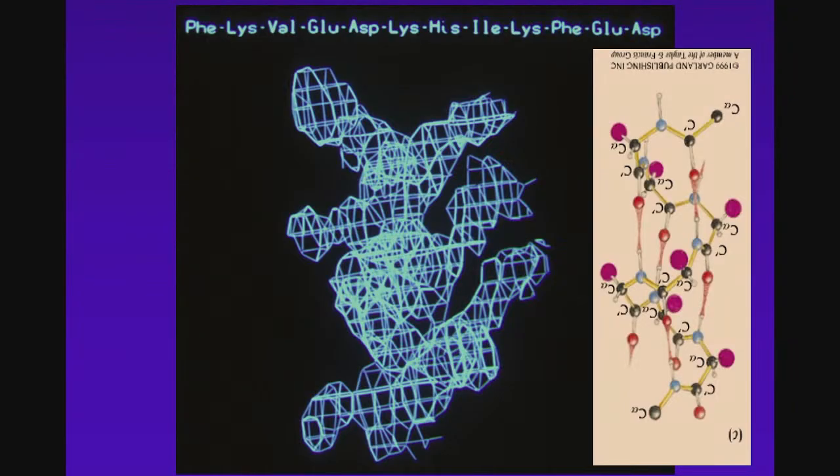So in the case of helix, you can sort of tell which way the chain is going, N terminus at the top, C terminus at the bottom, and then by looking at the shape of the side chains, you can start interpreting which residue it could be. For example, something like this, probably the phenylalanine, because round, globular structure is probably phenylalanine. So you can match that to the actual sequence of the protein.